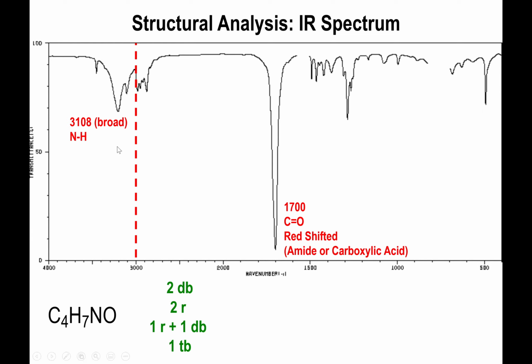In fact, if you look at the peaks right here, you have two separate peaks, broad in scope, above 3000, which could represent that there are two hydrogens present on that nitrogen. All right, now another thing that I want to highlight too is that there are no peaks in the region where you would expect to see triple bonds, right? So in that 2200 region, there's virtually nothing, which corroborates the idea that there are not going to be any triple bonds. And that's a good thing, right?